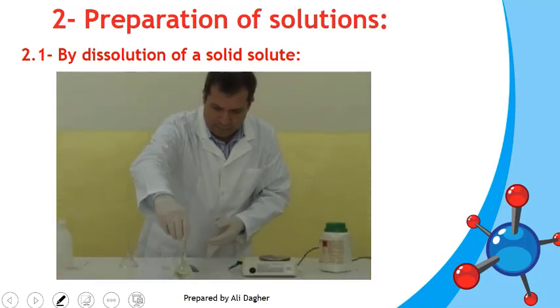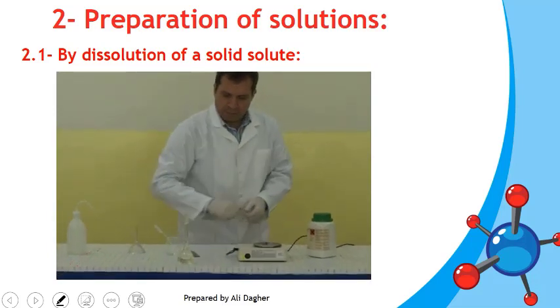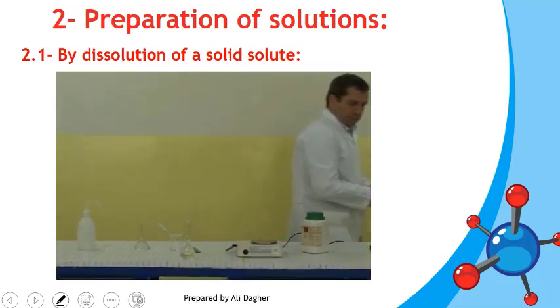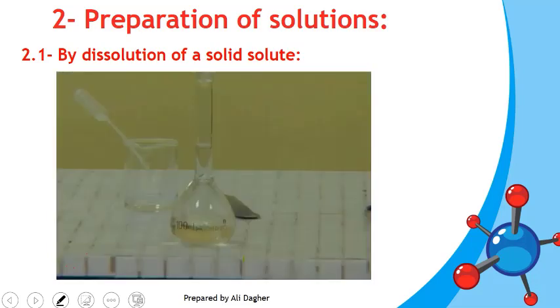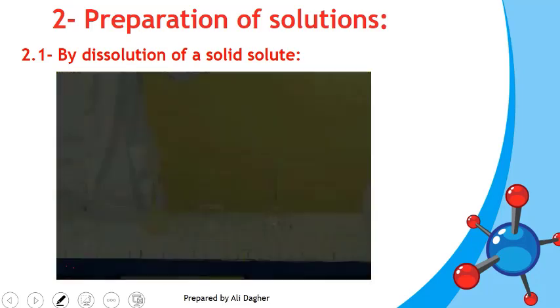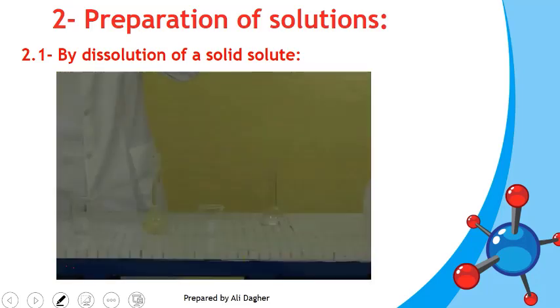Our eyes and the line mark should be at the same level. Finally, after shaking to homogenize, we obtain the final required solution.